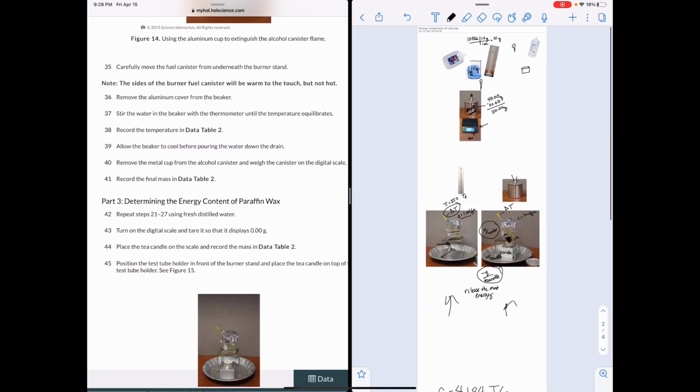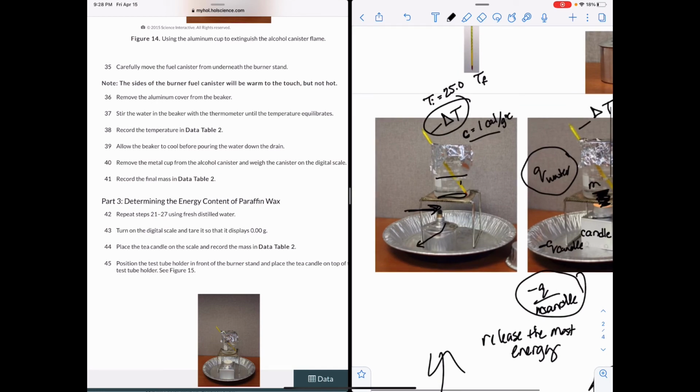But you're going to unwrap your foil. And as a little note, I like a little more foil on these. I think that it should go up a little higher on the thermometer. I feel like it should go down lower there. Just don't have it to the point where the flame is actually going to corrode the aluminum. But you'll take all that off.